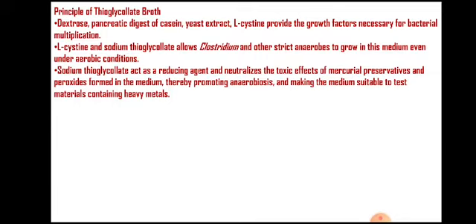Due to the presence of sodium thioglycolate, it allows the growth of strict anaerobes also, for example, Clostridia and several other strict anaerobic bacteria.